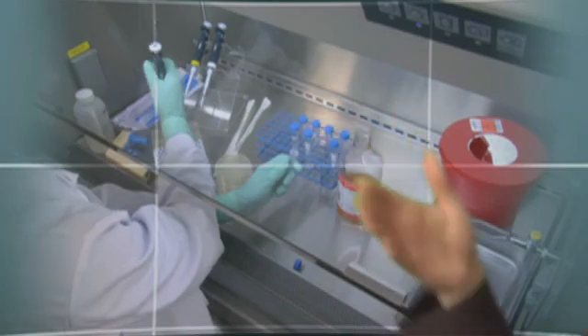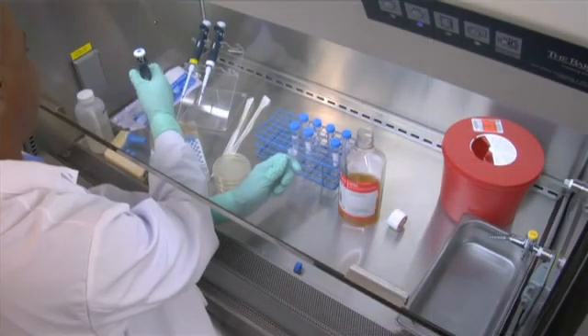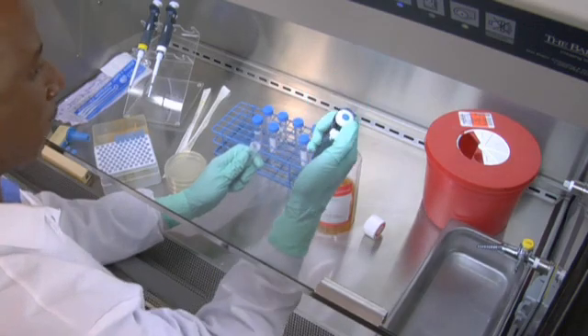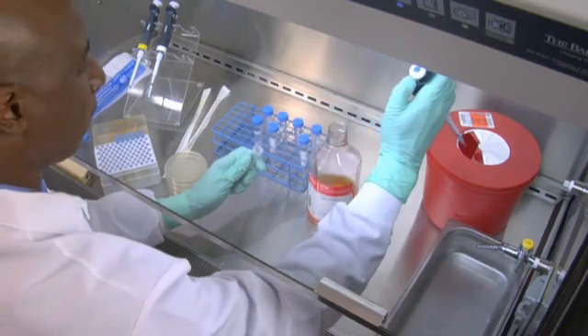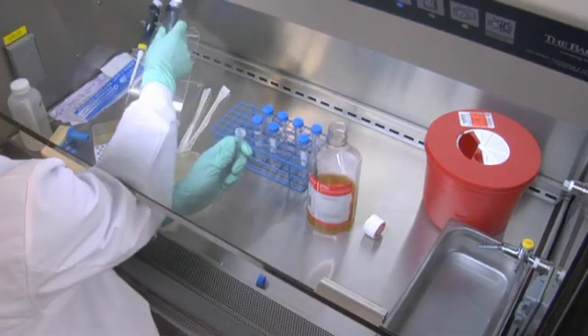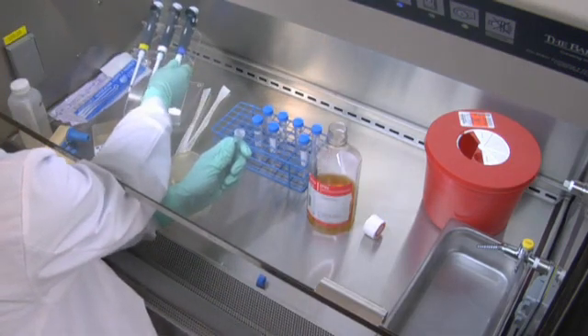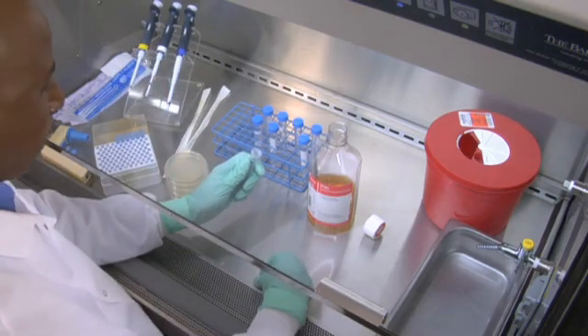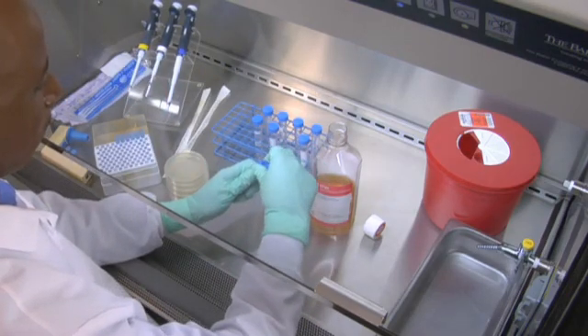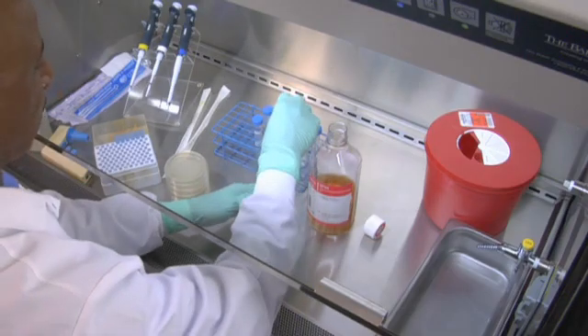Now that the cabinet is set up, let's watch Chris at work. He gets supplies from the clean side and disposes of contaminated items on the dirty side. He disposes of all work items, even pipettes, in the cabinet. Conduct your work in the center of the cabinet as far into the work area as comfortably possible, and make sure the grills are not covered. Move slowly and deliberately when working in the cabinet.